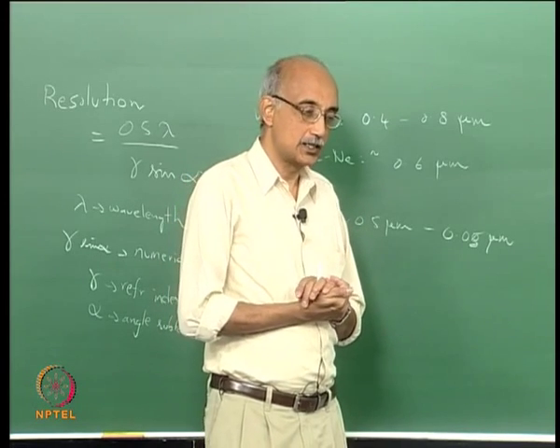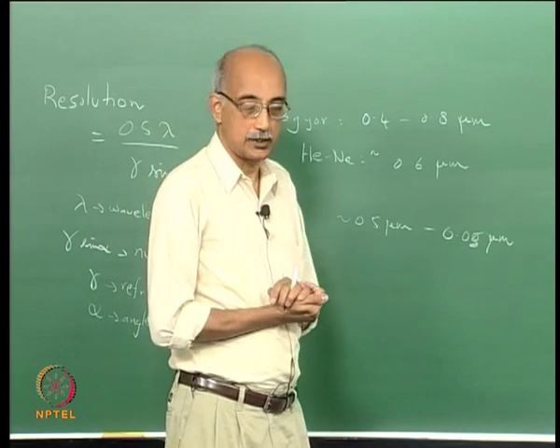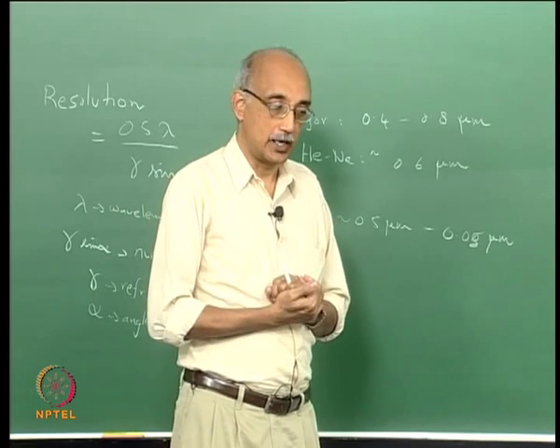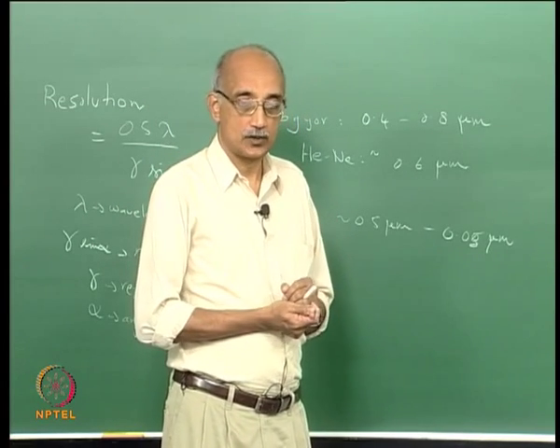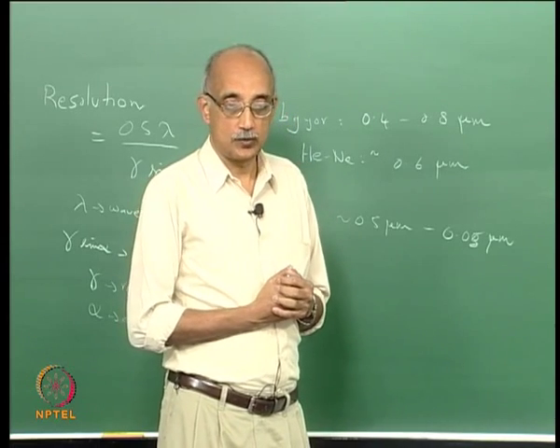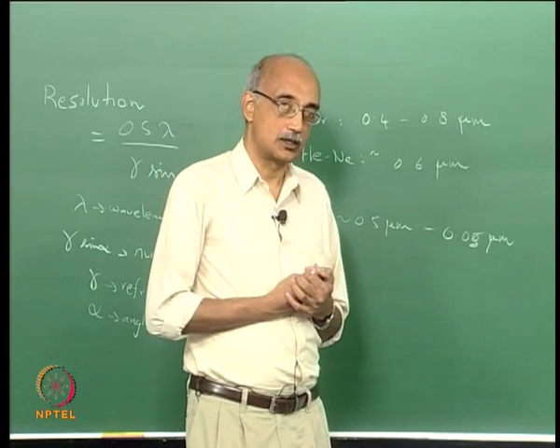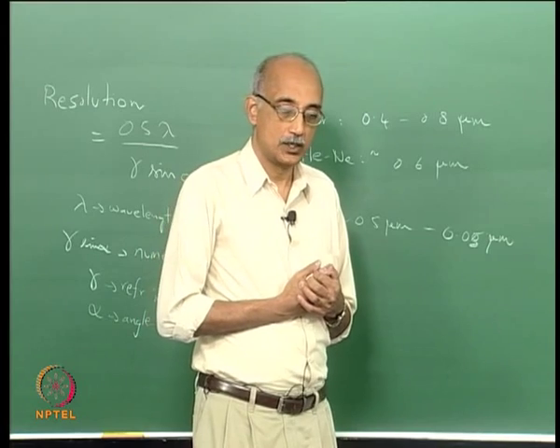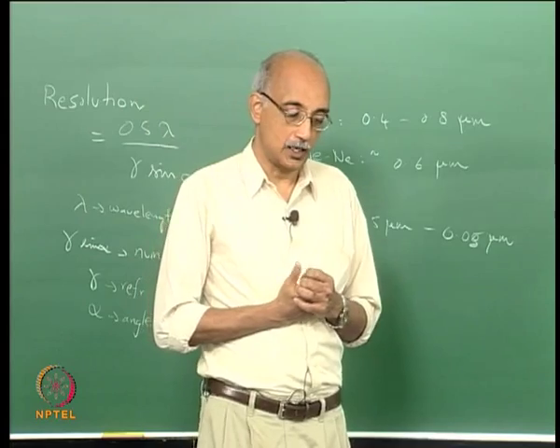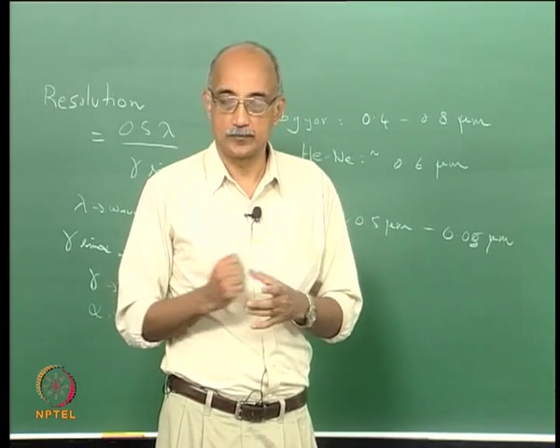One of the very sensitive properties that particles have is their ability to interact with a light field. They interact with incident light by either absorbing the light, scattering the light, or transmitting the light. And so by looking at these three characteristics, you can actually get a pretty good picture of the size of the particle. Light scattering from particles can be again assessed in two modes: individual particle mode and suspension mode.